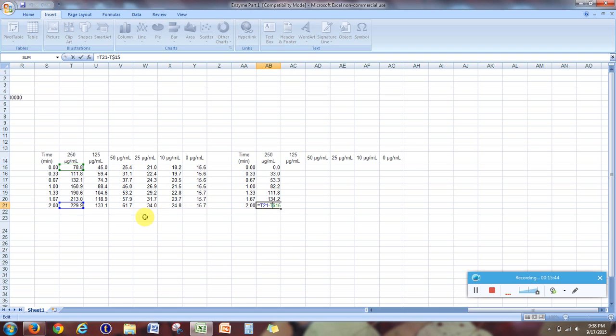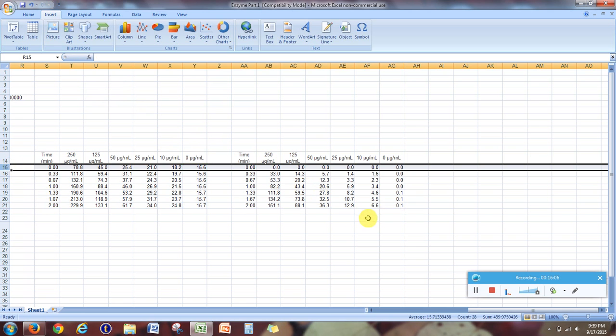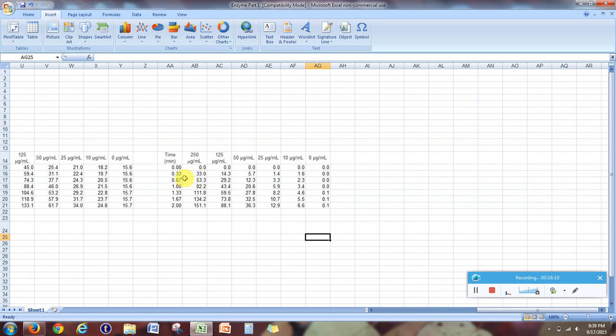you can see this one, it's taking the last value, subtracting off the top one. And if I copy paste this across, if I double click over here, it's taking the last value, and it's still subtracting off from the top one, but it has moved the column. It's moved over to column Y, which is what I wanted, but it's still pointing at row 15. So anyway, that's the last step.